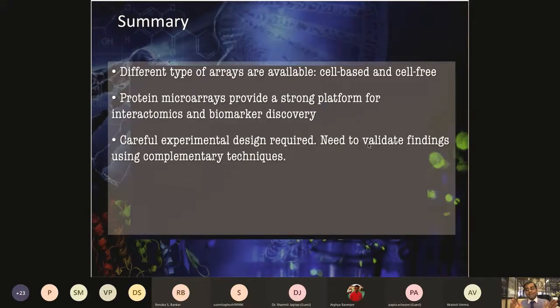After doing these, you can again narrow down your leads, and now you want to make a more miniaturized array, and you can apply that with a blinded set of samples. So now you do not know what is the control, what is the cancer, what is the grade type. You are taking all those 200, 400 samples in a blinded manner, and you are going to apply those on the final chip, and look at the response.